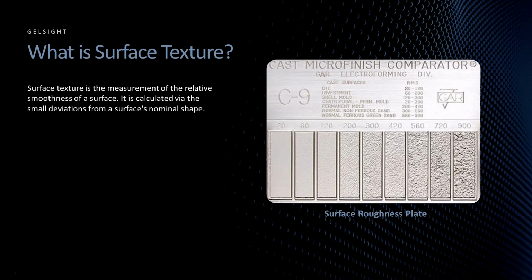In layman's terms, surface texture analysis is the measurement of the relative smoothness of a surface. It is calculated from the small deviations from the surface's nominal shape. The larger those deviations, the rougher the surface, and the smaller those deviations, the smoother the surface. As you can see in this image of a typical surface texture plate, it has several example textures. You can also see the surface deviations increase as you look from left to right.